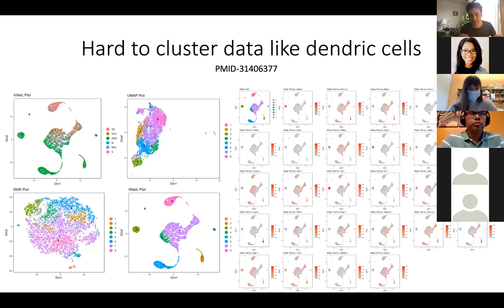Joseph has a lot better slides than I have because they're working a lot more in detail on this. But I just wanted to show you a few markers that they were interested in. This is from a published data set. So Ly6D, they were interested in. It comes up in cluster number 2, with better distinction, and a few of the markers that they were interested in, I turned them on here and they come with distinction. And this is my belief, but Joseph can elaborate on this. I was thinking maybe these are one cell type and they're in fact separated by the cell cycle. Here we did some cell cycle analysis and I saw that they're differing in terms of cell cycle. Maybe Joseph can talk more on that too.